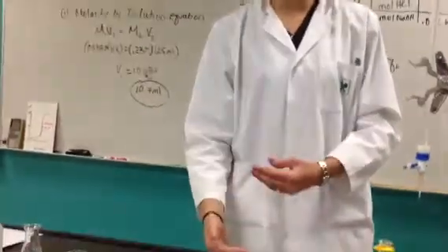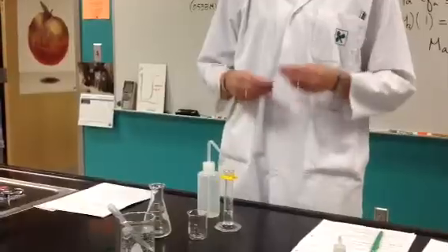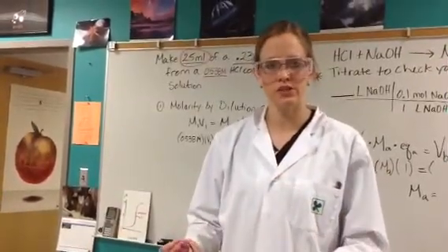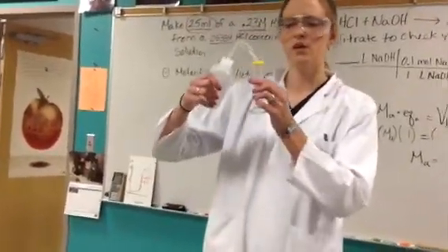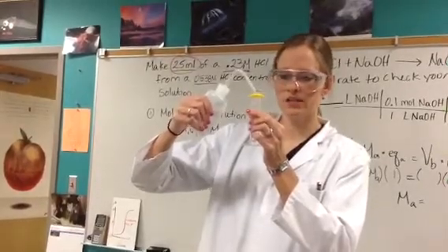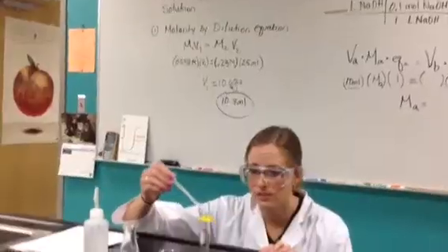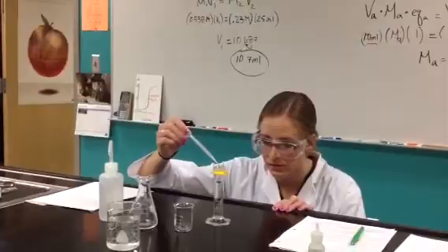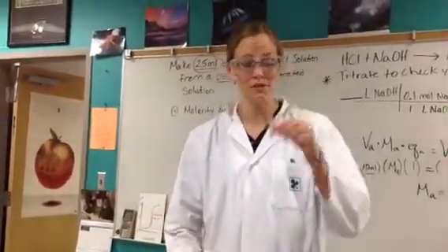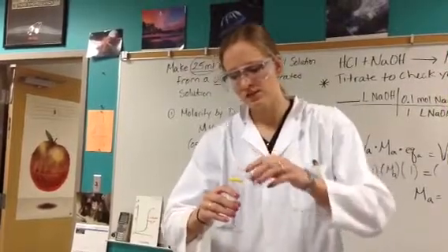Once I've recorded my total acid concentrate on my data table, I'm going to go back to my station and use the squirt bottle to fill the graduated cylinder to 25 mils. Just like in our Beer's Law lab where we made our concentration solution, we don't want to go over 25 mils because that will affect the concentration. I'll fill up to just below 25 and then use my pipette to get right to 25. Then I need to mix my solution in my dry 50 mil beaker — a couple of times is adequate.